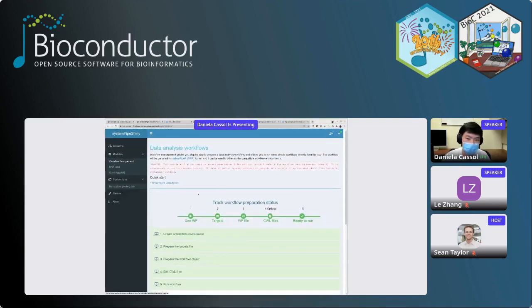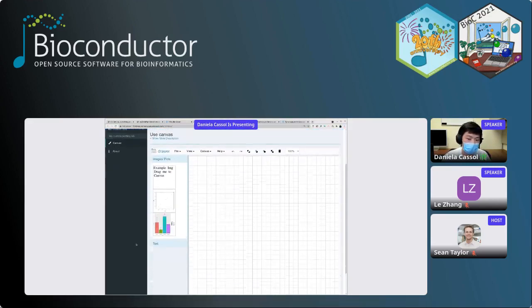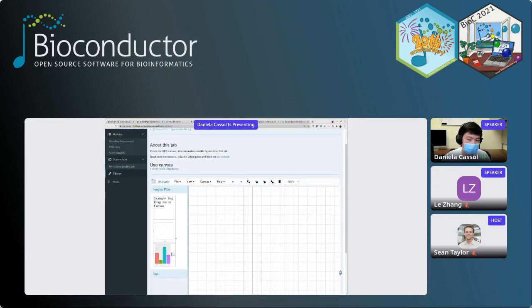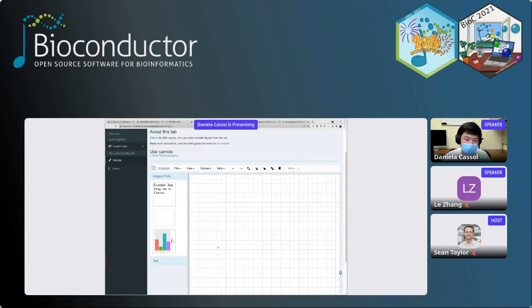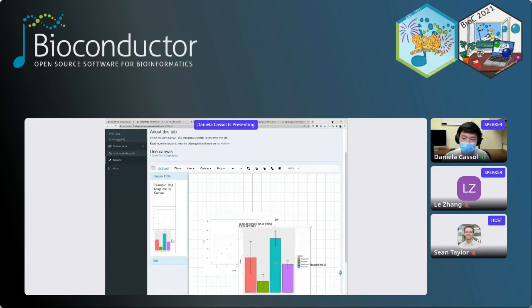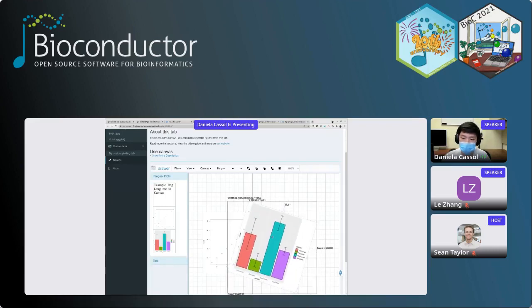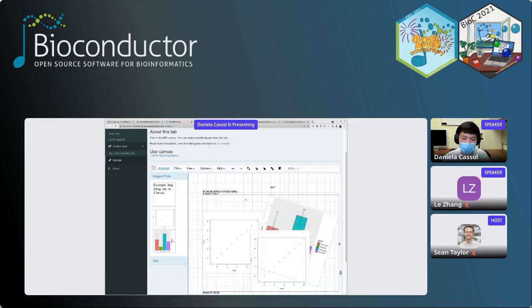So I just directly go to this module, the Canvas module. Remember, I hit the button twice and sent 2 screenshots. Then those 2 screenshots become available in this module. Then what you only need to do is drag those plots you want to the workbench and resize, change the angle, and copy paste. Keyboard shortcuts like Ctrl-C, Ctrl-V are working.